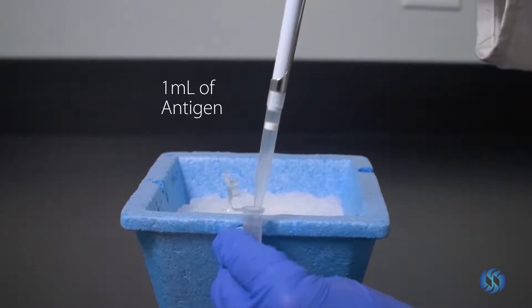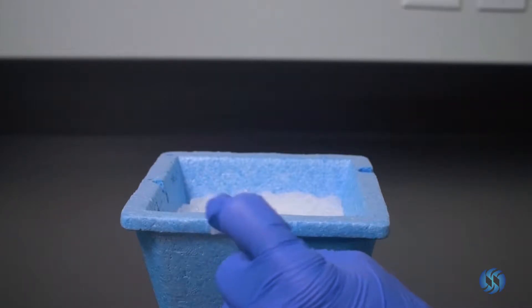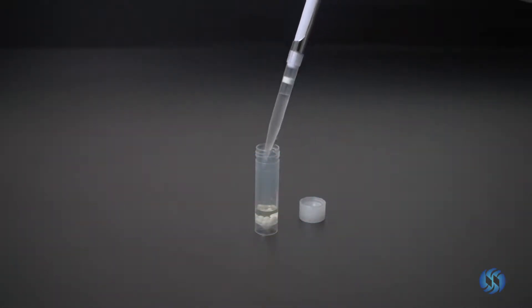Use a pipette to extract one milliliter of antigen. Inject the antigen into the 7-milliliter tube.